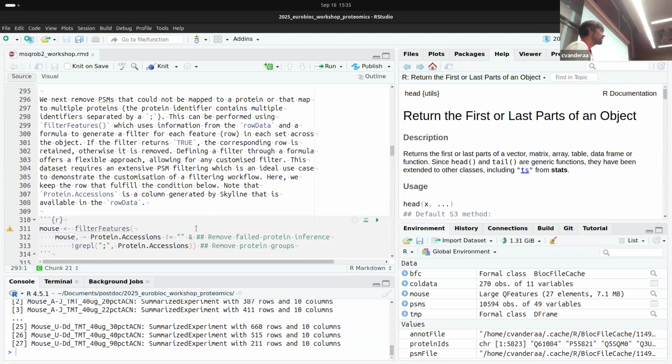Yeah, this is actually a good point. There is no direct function that we provide to do that. I will show afterwards, you can also customize your filters. Here I didn't demonstrate how you can customize the filter in that specific context, but you could provide some measures to do it yourself indeed. Yeah, that's possible.